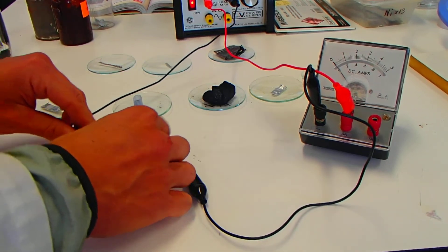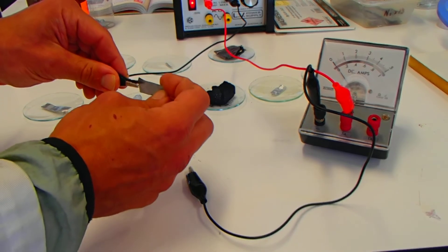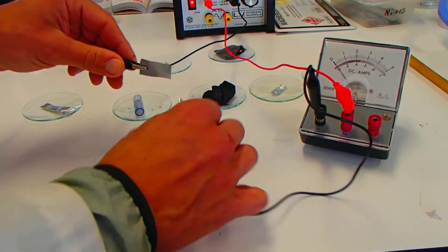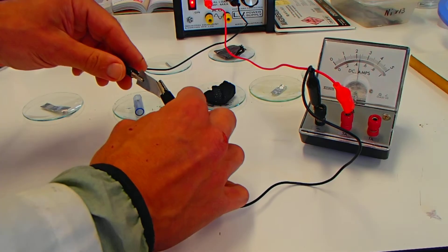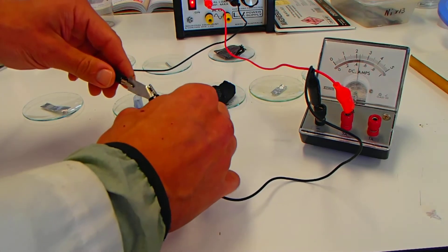Here we go for the sample of zinc. One there. And one there. Yes. Conducts electricity. We're getting some reading there on the ammeter.